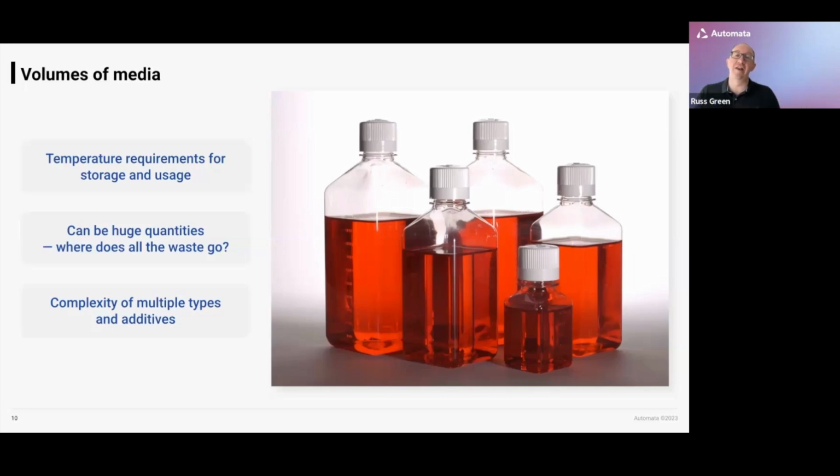Then there's another layer of complexity, which is a little bit different and starts making it more of a process problem when it comes to automation. Let's say we have basal media into which we want to add some kind of additives to make up specific variants of that media for different cell lines on the fly. That's something we might do quite naturally in a manual environment. We can certainly build it into automated systems, but it adds an awful lot of processing complexity, where we need that volume of media to be delivered to a liquid handler and then have those additives ready and probably held at some temperature to be added into that media as well. None of these things, again, impossible. They're just things we have to think about.